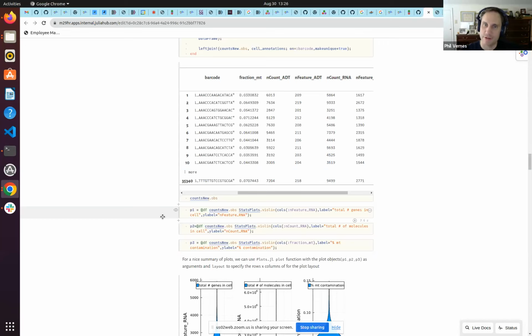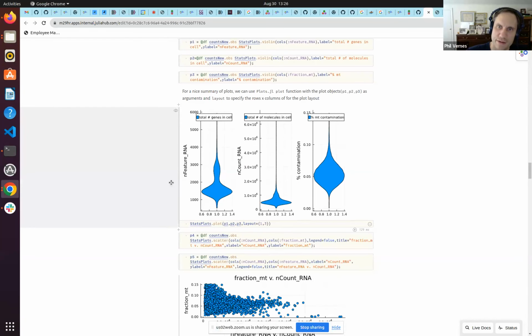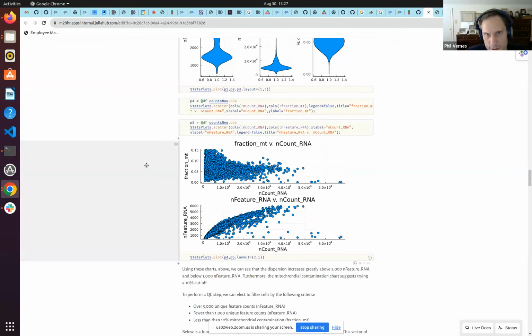Let me jump back into, okay, I'm going to finish these plots. I'll show how the plots are developed, and then we're going to move on. Another thing I'm very aware of is that people do this differently. There are people who have different workflows, and I get it. This is just to illustrate one simple approach. I know there are various opinions on how to do this. So again, we're using the StatsPlots.jl library here to generate these violin charts.